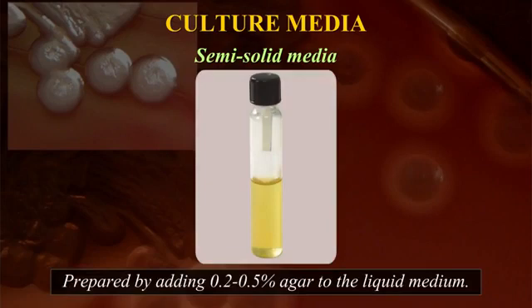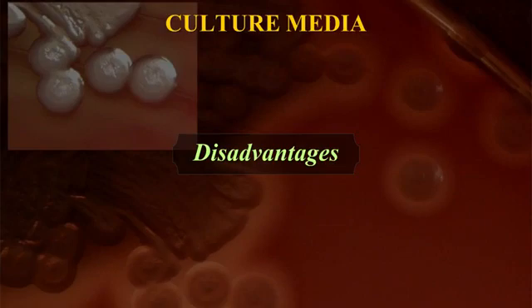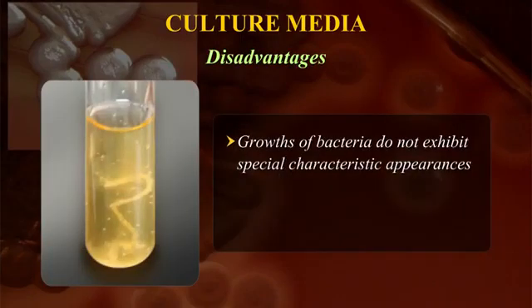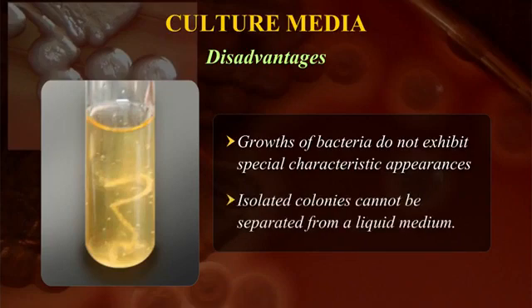the liquid medium. Though liquid media can be fortified with different nutrients and permit growth of most bacteria, there are certain disadvantages as compared to the solid media. First, growths of bacteria do not exhibit special characteristic appearances and hence are difficult to identify. And second, isolated colonies cannot be separated from a liquid medium. Both these deficiencies can be overcome by a solid medium.